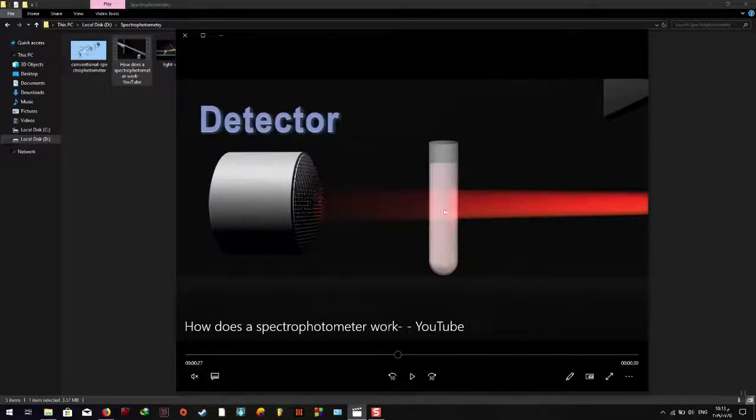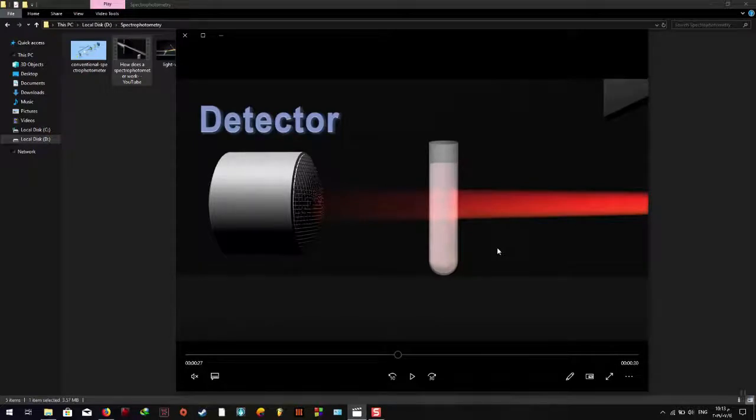Now, why do we see that the intensity of the light here is lower than the intensity here? In our world, every sample, every element, every molecule has electrons with a specific wavelength, such that if you strike it with this specific wavelength, its electrons will absorb some portion of this beam of light. The electron will gain energy and transition to a higher level, or the covalent bond will change to be vibrating or rotating.